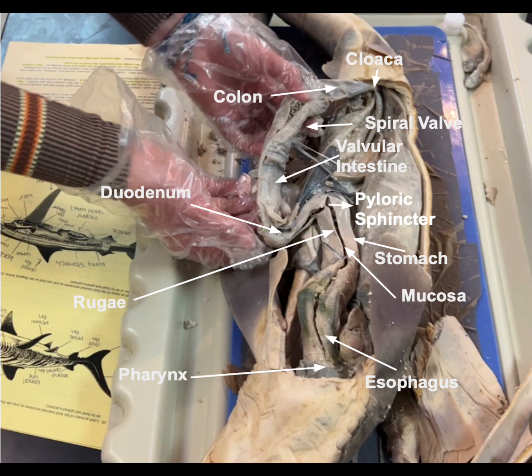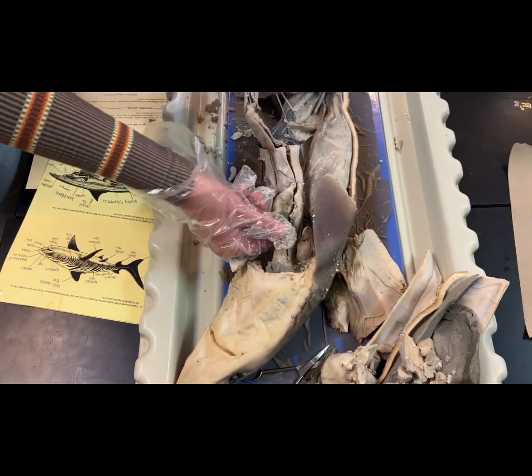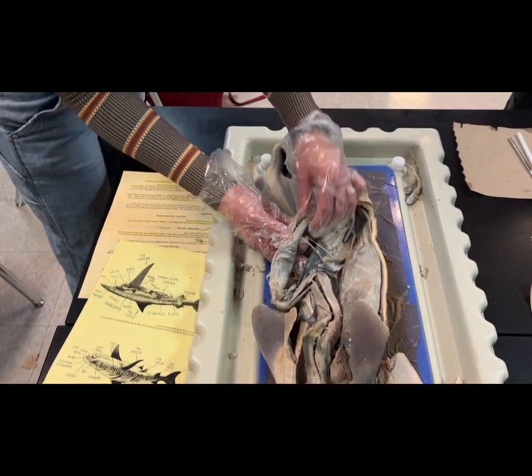Sharks can have very short intestines, yet still get all the nutrient absorption they need through a structure called the spiral valve. It's a screw-like structure inside the valvular intestine. It aids sharks in significant nutrient absorption because it provides more surface area for digestion and absorption to the short intestine. Without this, the duodenum, which connects the stomach to the valvular intestine, wouldn't be enough to get all the nutrient absorption needed. This is the shark's esophagus, which goes up in here to the J-shaped stomach, connecting over here to the intestines.